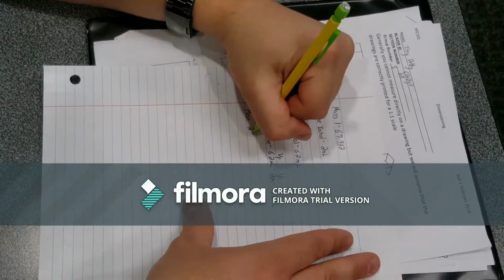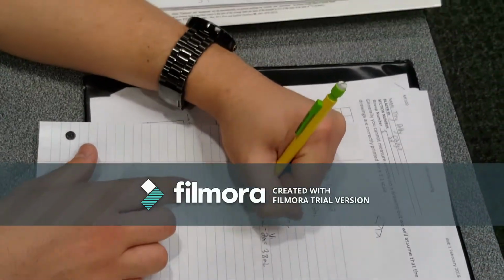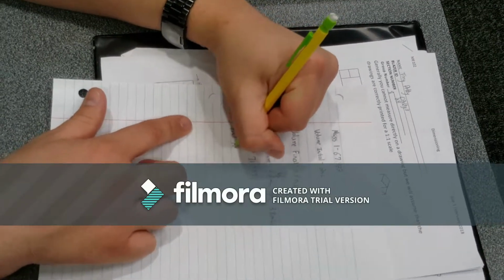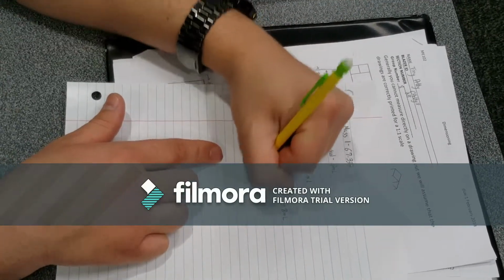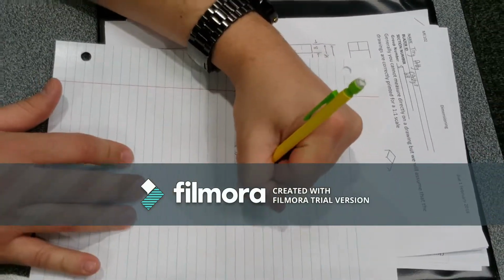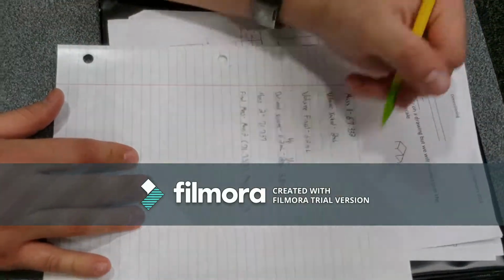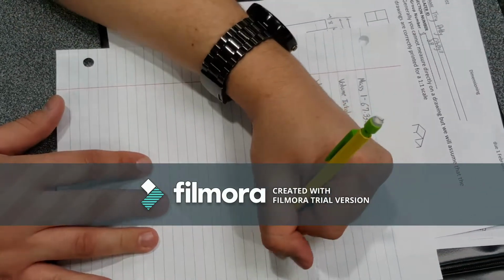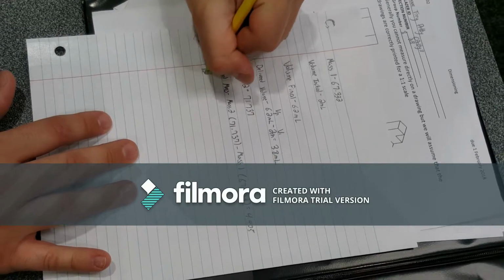And then the mass 2 is what we measured when we weighed the beaker again with water in it, and this time it came up to 71.737. And then what we're calling the final mass was taking the beaker out of the equation. So you take mass 2, which is 71.737, minus mass 1, which is the number we put aside over here. That is 67.332, and the total on that came out to 4.405.